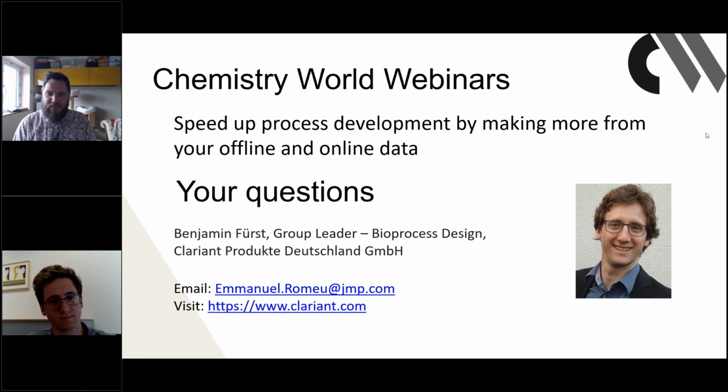You really do need to take that first step of just understanding what data you have, how you have it, making sure that it's clean and tidy, formatted correctly, and only then can you really start to properly interrogate it.